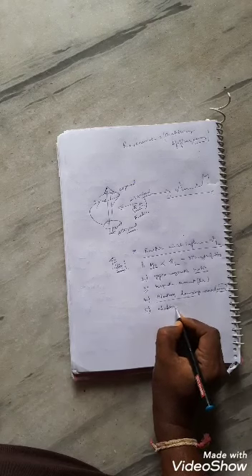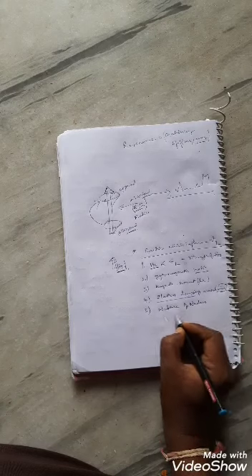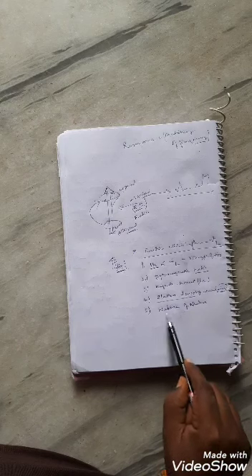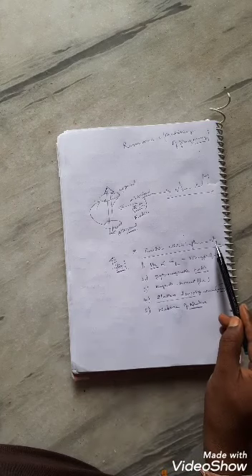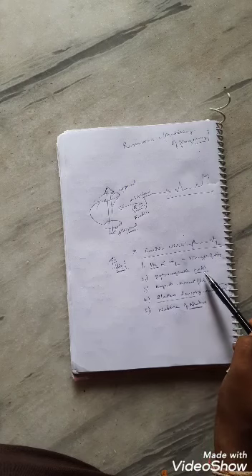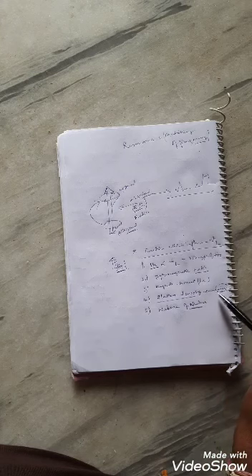So these are the factors which will influence the Larmor frequency or precessional frequency: strength of the external magnetic field, gyromagnetic ratio, magnetic moment of the nucleus, electron density around the nucleus, and nature of the nucleus.